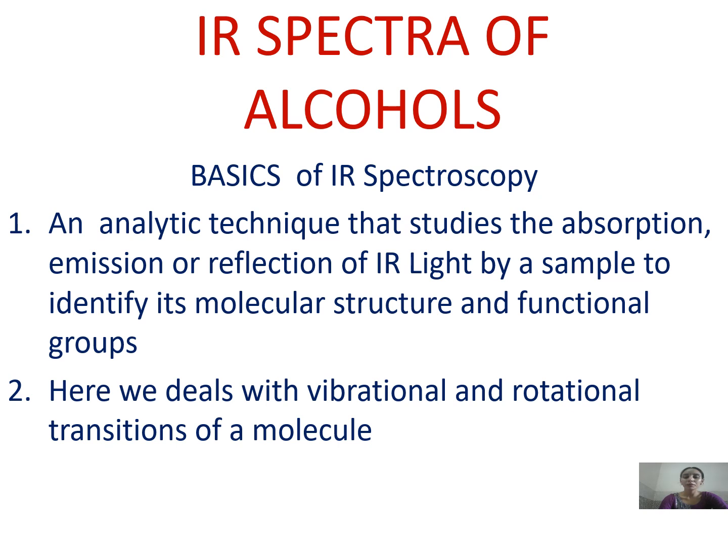Today I am here to present IR spectra of alcohols. Before discussing the IR spectra of alcohols, we will first discuss the basics of IR spectroscopy.